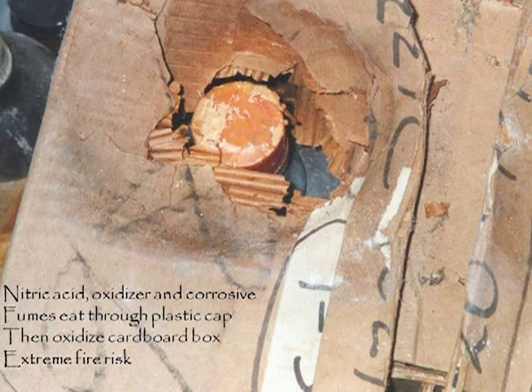In the photo here, you see a brown box with a little red circle in it. That red circle is a cap to a nitric acid bottle. Nitric acid is a very highly corrosive oxidizing acid, and what it will do is eat through its cap in about 7 to 10 years. So if you've got a nice new bottle of nitric acid and you leave it sitting there, in 10 years your nice new bottle of nitric acid is now working its way out of its cap, evaporating and spreading through your entire laboratory. If you find yourself coughing every time you open your acid cabinet, if you find yourself catching colds that never seem to go away, it may be because you have a leaking bottle of acid in your lab.